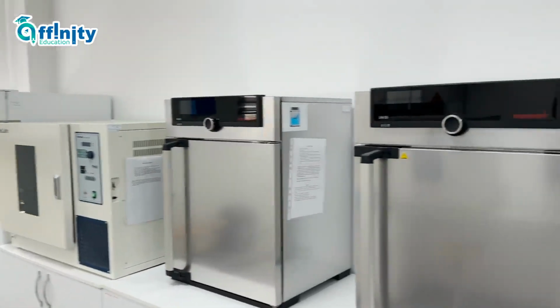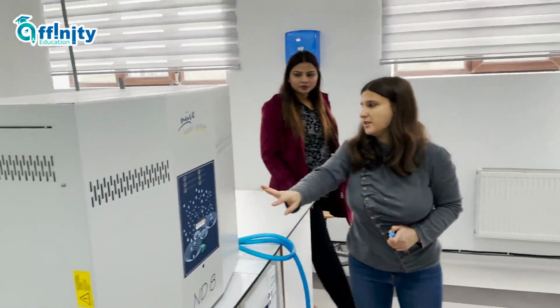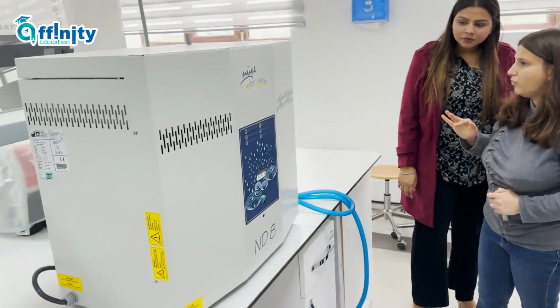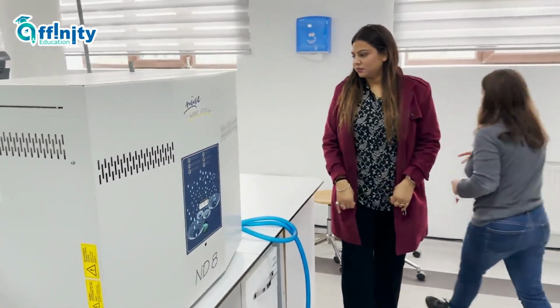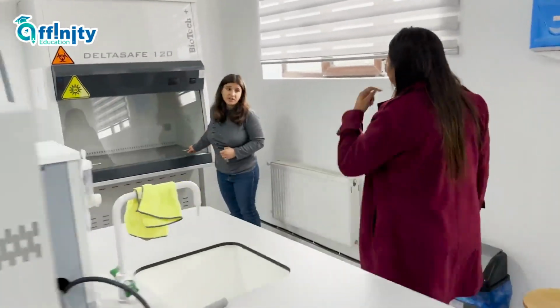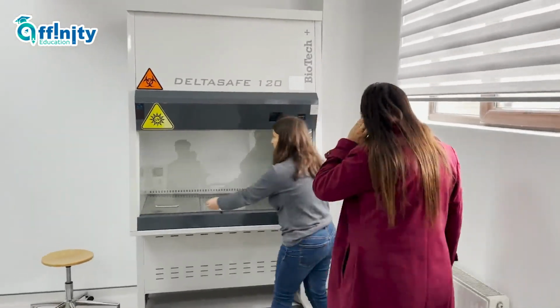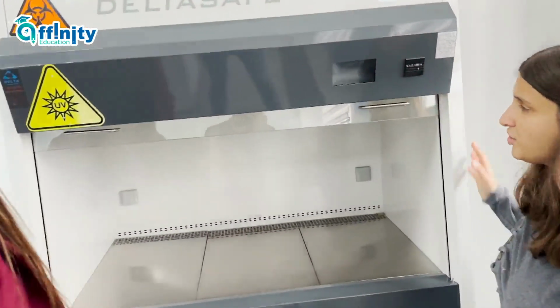This is the distillate, to have distilled water. Distilled water is only H2O. Only, without any fixing and everything. This one is for dangerous microbes. Because this is a special cabin.